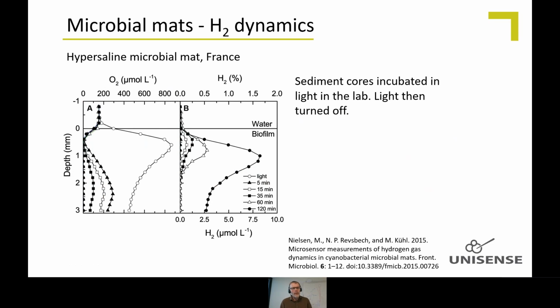They also used them in the same study, but in France in a hypersaline microbial mat. They were measuring oxygen in light, and also hydrogen, and then they turned light off, and then it's 5, 15, 35, 60, and 120 minutes after they turned off light.